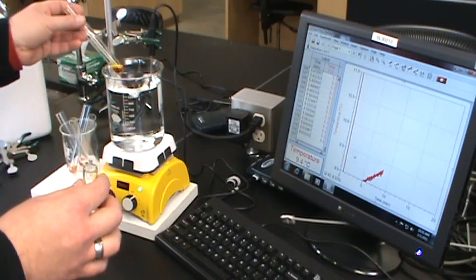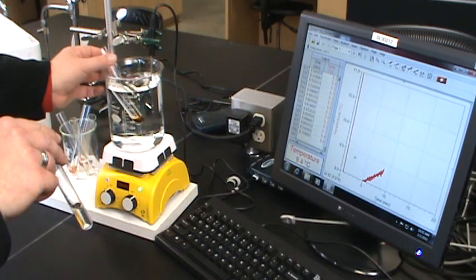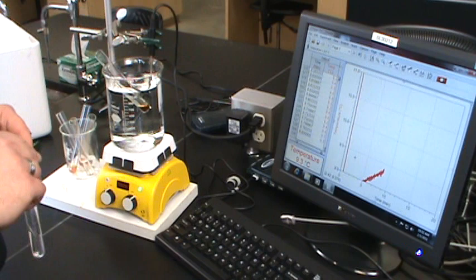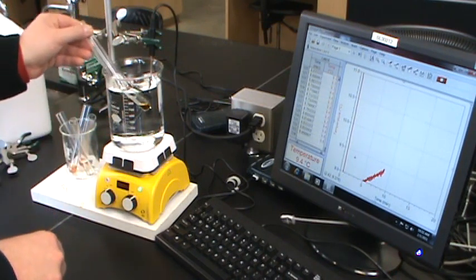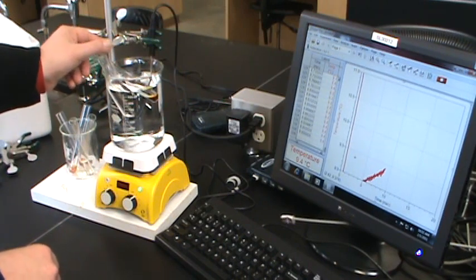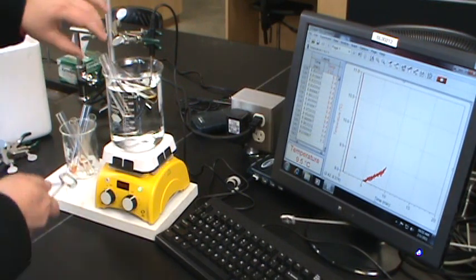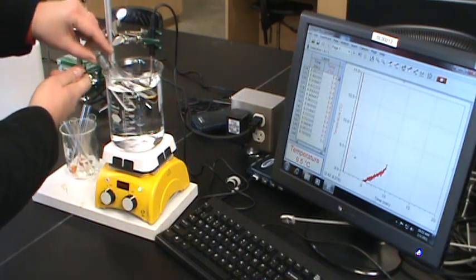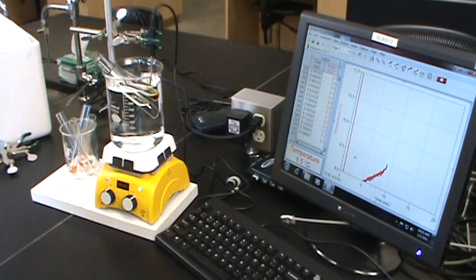Now, we could set up a whole bunch of clamps on this ring stand and hold them, but for this experiment it's pretty convenient, especially with the iodine. We can just set it in there and it floats. That's not bad. With your other sample, there's more liquid in there, so it's a little bit denser. Sometimes those will float okay, sometimes they're a little low. You see it's swirling around a touch. If you want it to be a little bit more stable, there should be a test tube clamp in your drawer. You can always just throw the test tube clamp on that and that'll hold on to it.